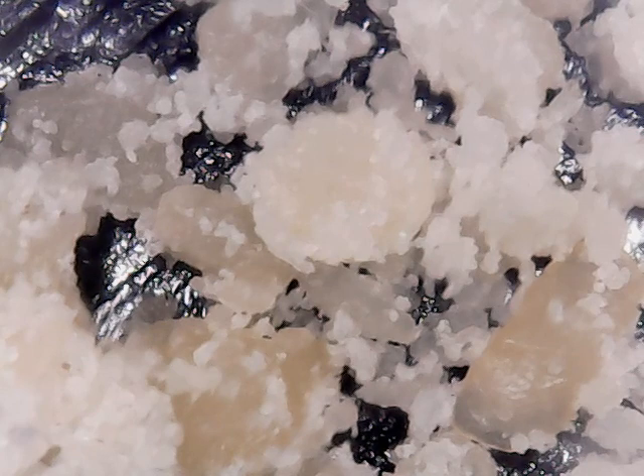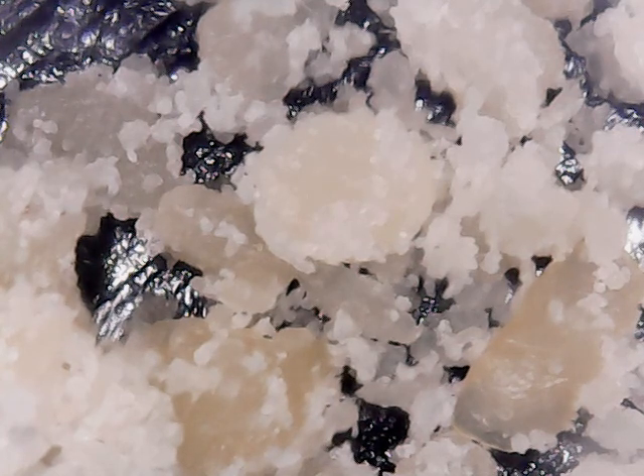They look a lot different than the rest of it. It doesn't even really look the same at all. When you look at it normally it just looks like normal chunks, but if you look at it on our microscope it's big chunks attached to smaller chunks, and then a whole bunch of free-floating small chunks.